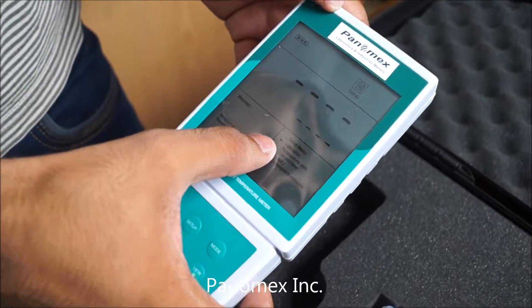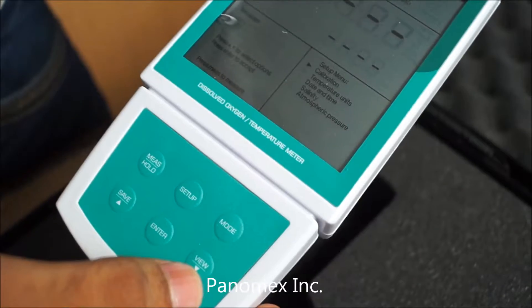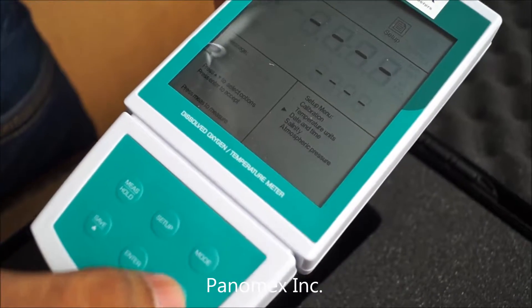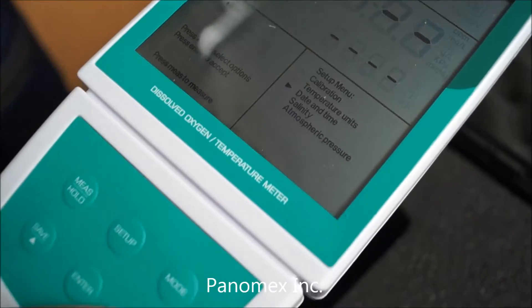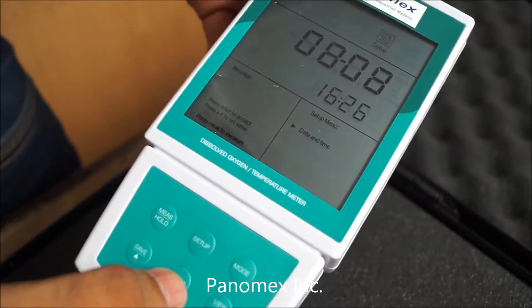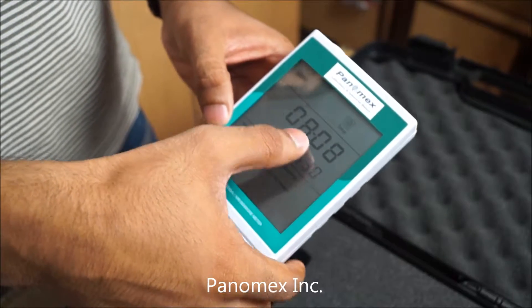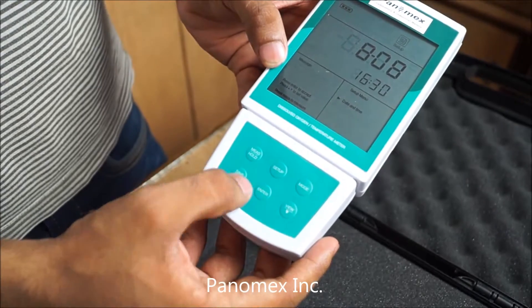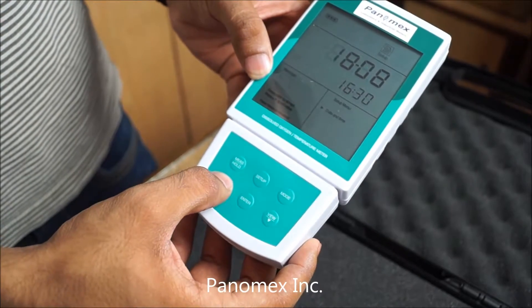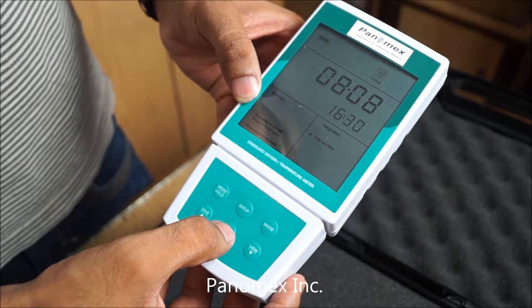To set date and time, first press the setup button. You can see numerous options. Use the up and down keys to select date and time. Now the arrow icon is on Date and Time — press Enter to go to settings. This is the date, this is the month. You can edit the blinking number using the up and down keys to select the number, then press Enter to save and move to the next number.